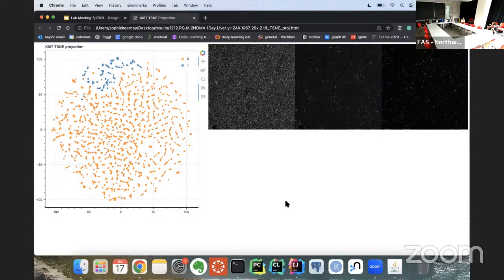We need to somehow use some model to convert that into a scalar. That scalar is supposed to be a number that gives you an idea of how much that treatment causes this readout. Then we do that Fisherian statistic that I still don't understand, but we can talk to Mariabel. Then we can come to a conclusion saying whether that actually had an effect, or what the p-value is. That's a really good idea. I think that would be a nice way to wrap up everything. Yeah, sounds good.